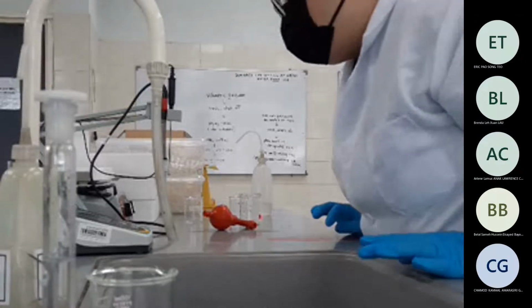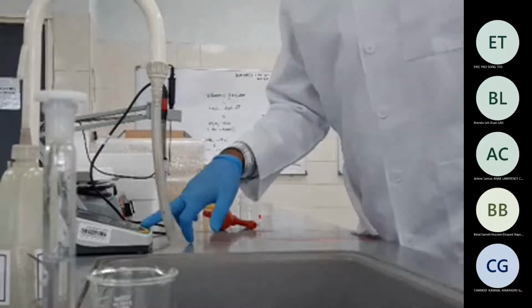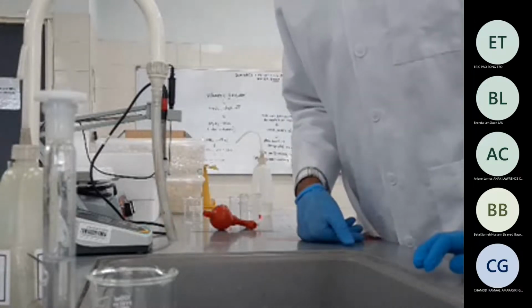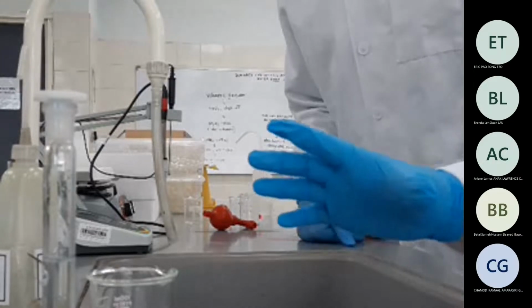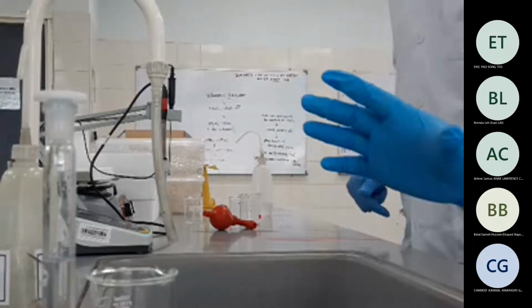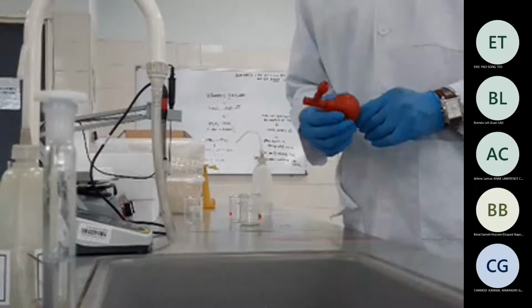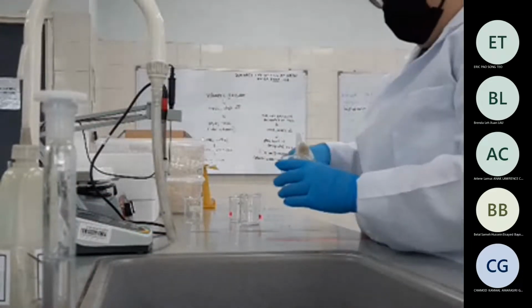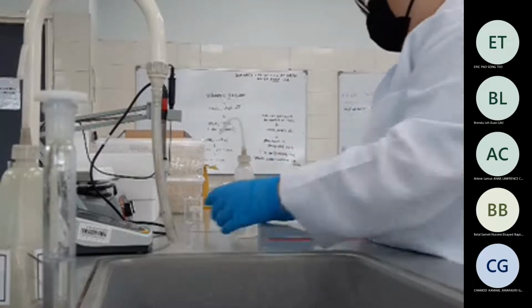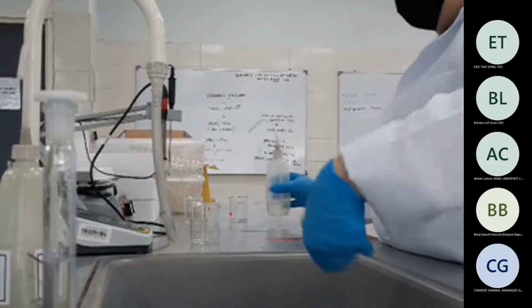Vanessa, you done? Both? Good. Okay, it's already calibrated. This is a buffer solution so that the probe does not get dry and it maintains the neutral pH, or the pH is designated to some extent.